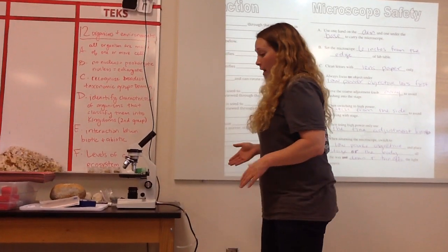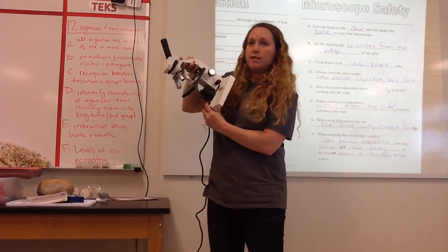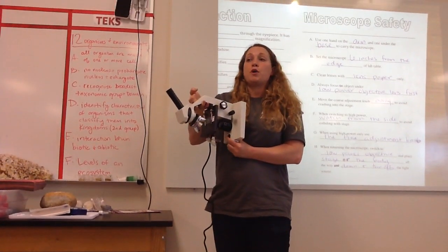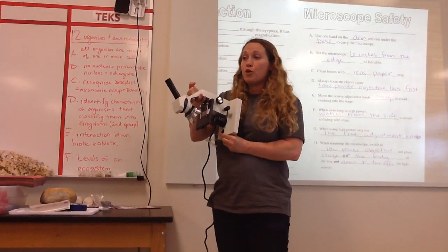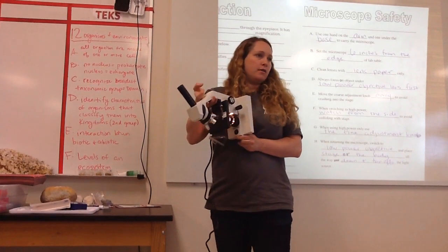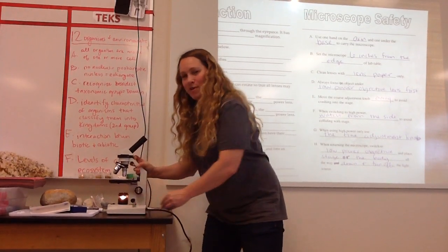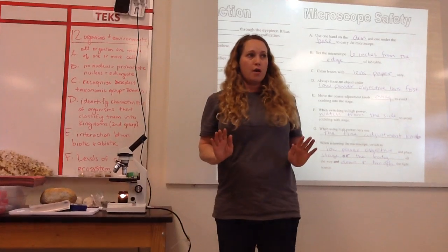Now, it isn't on. There's an on switch right here, or maybe somewhere else on your microscope. It's really easy to turn the light on. So some microscopes have mirrors, and some have lights. Ancient microscopes were all mirrors because there was no electricity back then. But today, we're really lucky because it's a lot easier to use a light bulb. Boom. That's it. It's on. Turn on? Yeah. That would have been embarrassing. Okay, so it's on. It's away from the edge. The slide is in place. And I'm good to go.